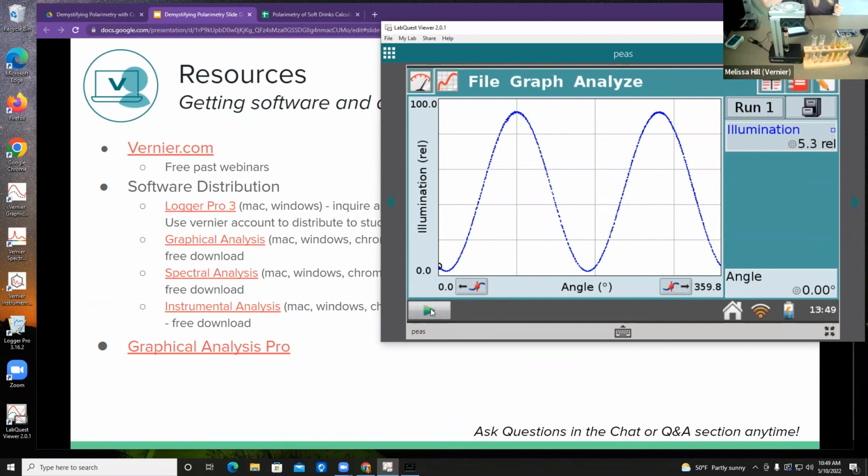Sorry, I don't know if you saw me rotating it, but you just rotate like this as the cosine squared waveform comes in. So now I have to determine water for myself. So I can do everything we talked about previously. I can do statistics and I can do cosine squared.